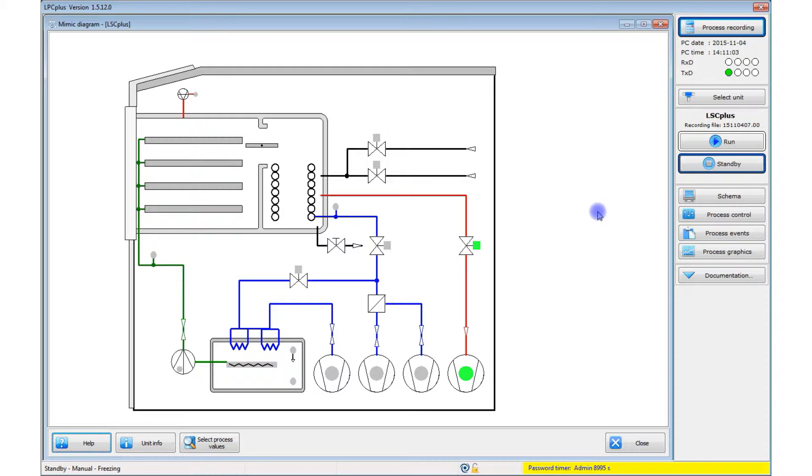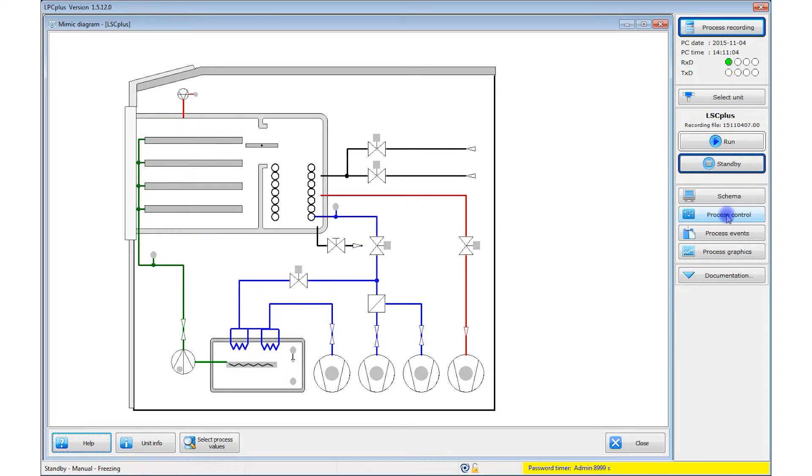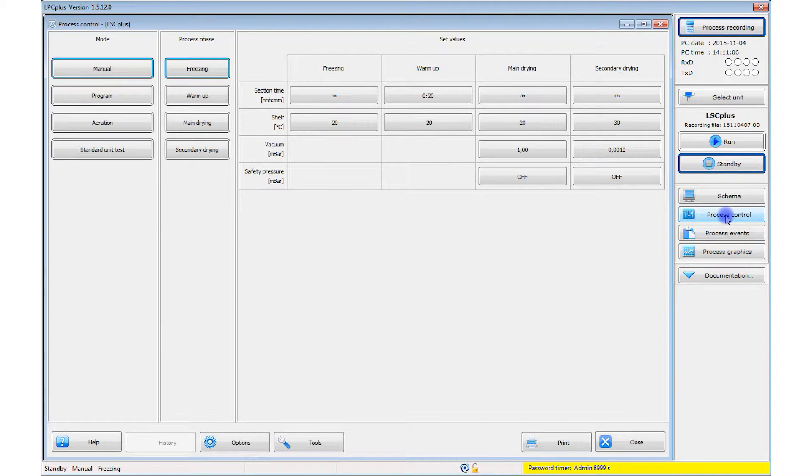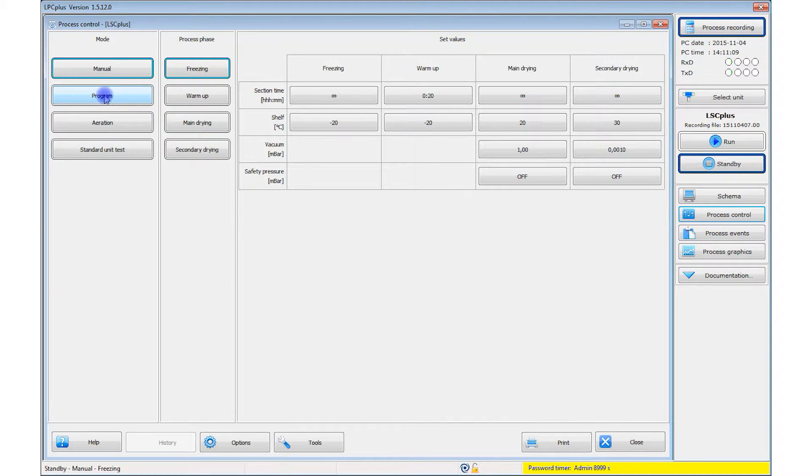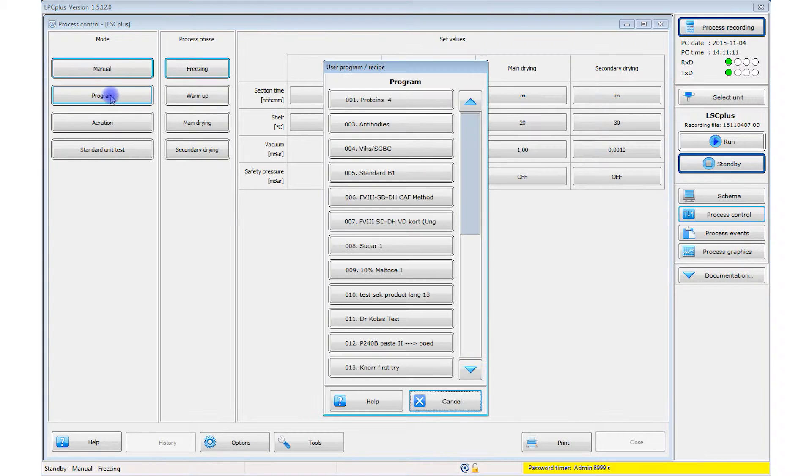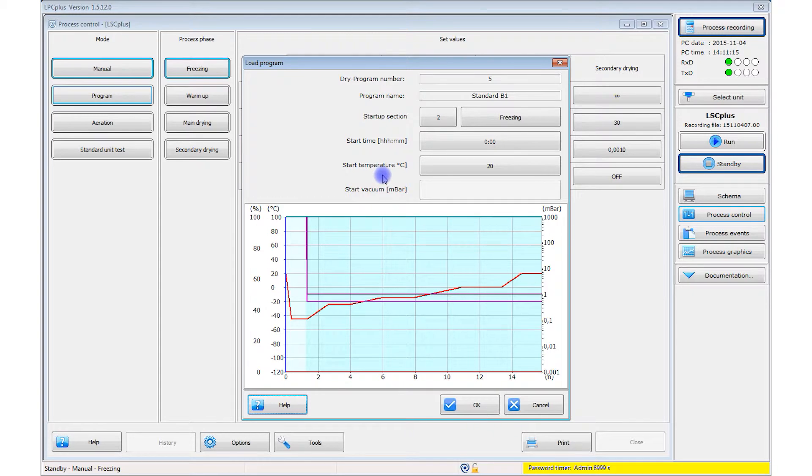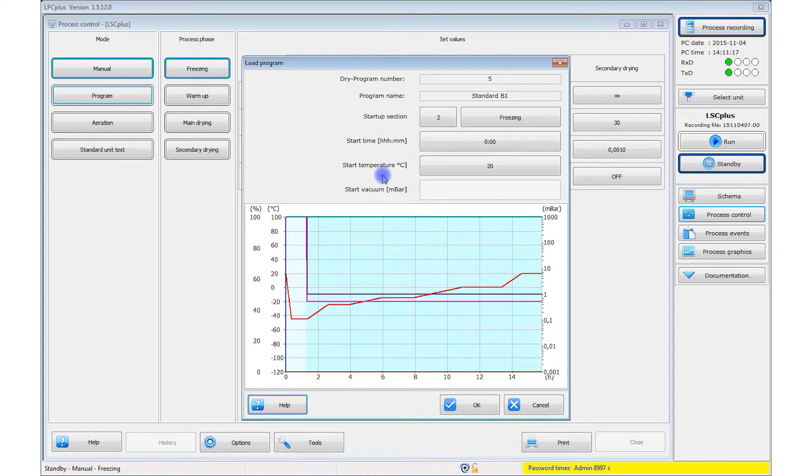To start a process, select the process control menu item. In the window that opens, go to program. Select a stored recipe from the integrated recipe library. After you select a recipe, you see a graphic with a process curve.